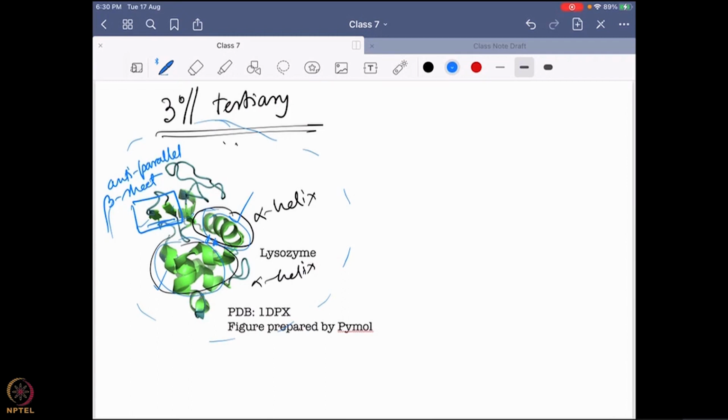And over here, very interestingly, you can see there are some particular portions which are actually floating around without particular alpha helix and beta sheets. Those are known as random coils. That means they are actually having some interaction among their backbone, but they're not really well defined as alpha helix or beta sheets. And they're also very important because they actually create the turns and connect the alpha helix and beta sheet.